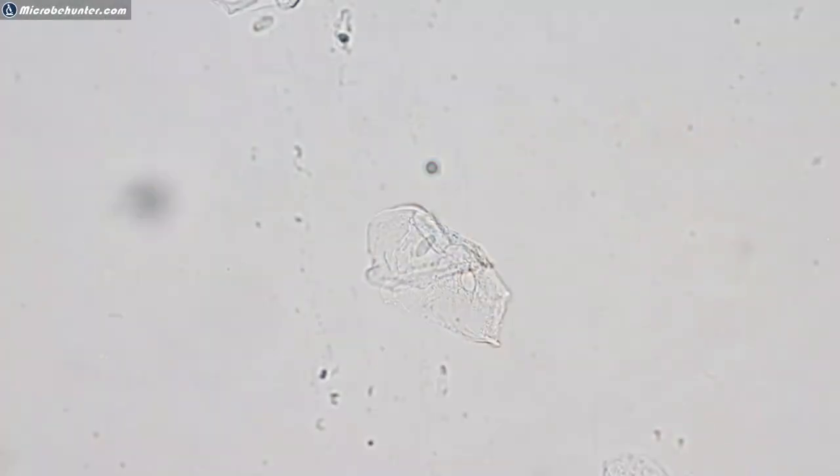So what I'm going to do now is the following. I'm going to now do the same thing again, and I'm going to now stain everything with methylene. No, I forgot to do something. I forgot to actually show it to you in phase contrast. That's what I wanted to do, okay? So what I'm gonna do now is switch over to phase contrast. Of course, that's something I need to adjust the condenser first.